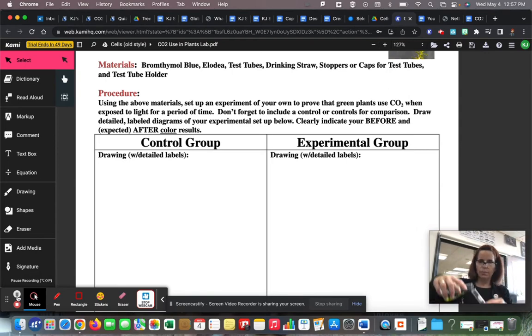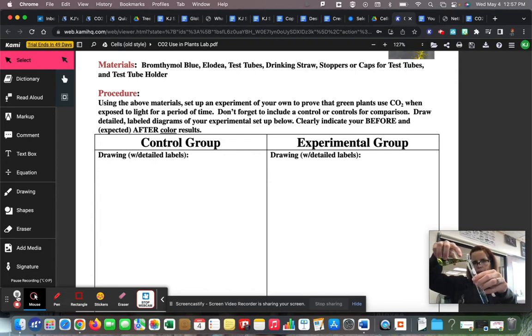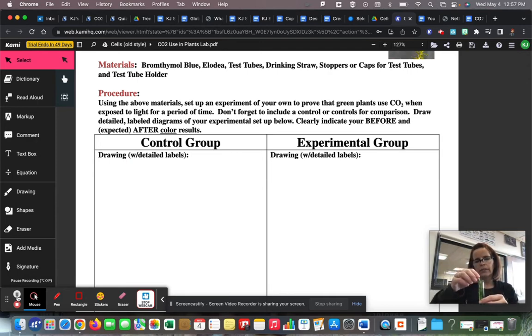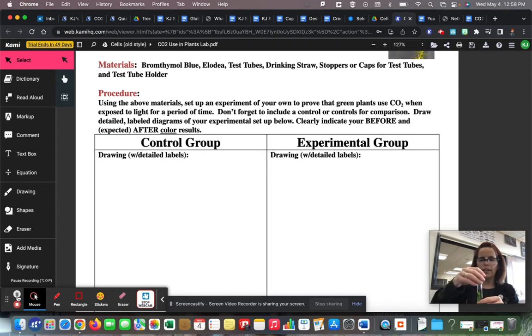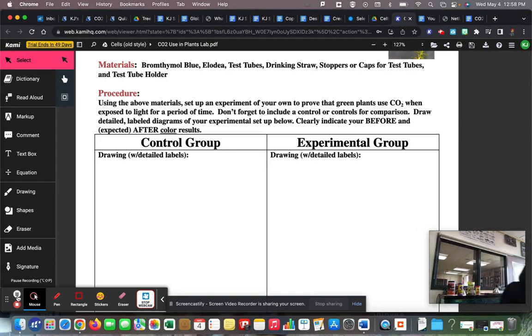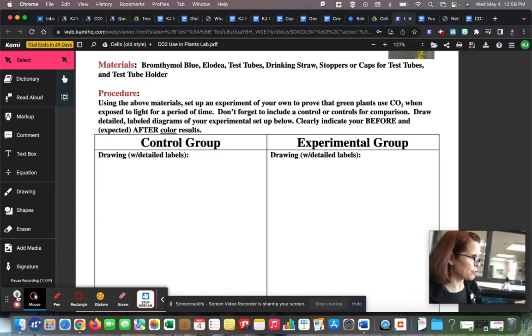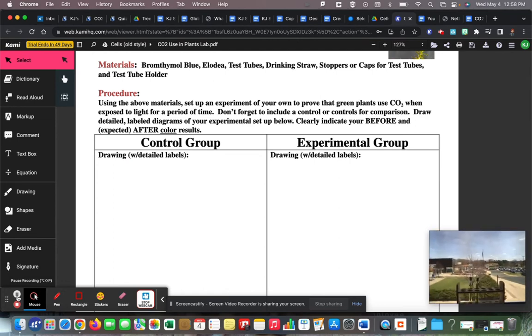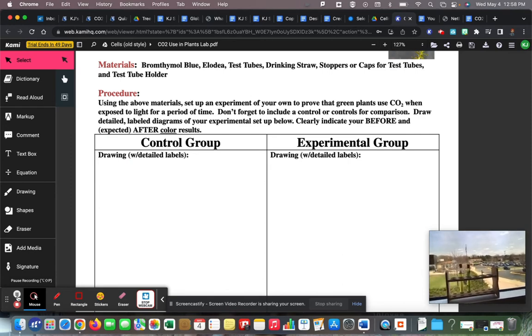In the control group we didn't put a plant in it — we just want to see what happens to the yellowish green water. Does it change colors all by itself, or does it stay the same? We'll go put these in the window. Can you see them? They're kind of green — we'll check on them a little bit later. I might grab a lamp to shine on them. We'll check back in about half an hour, then let's go ahead and draw the control group and the experimental group.